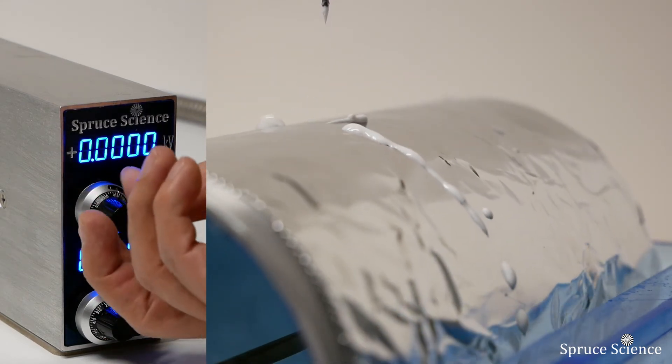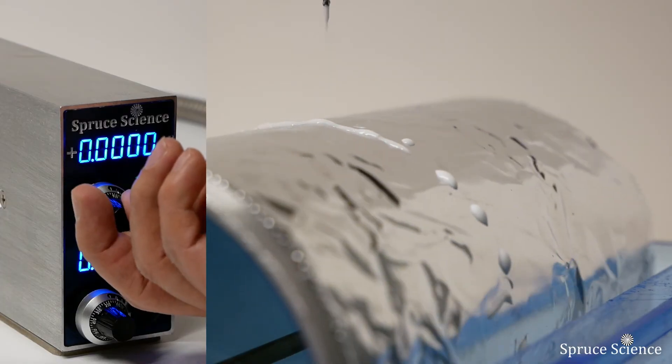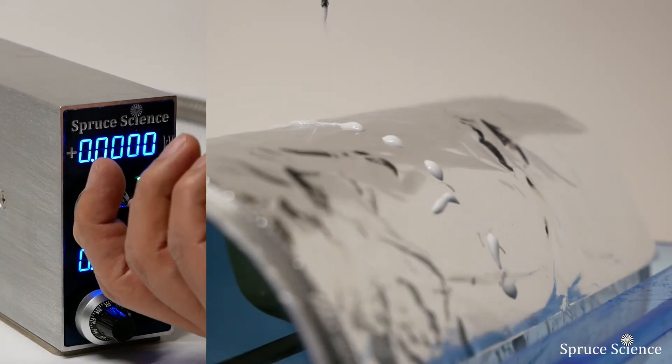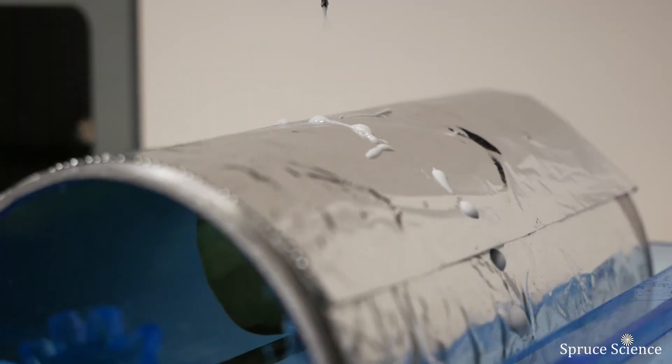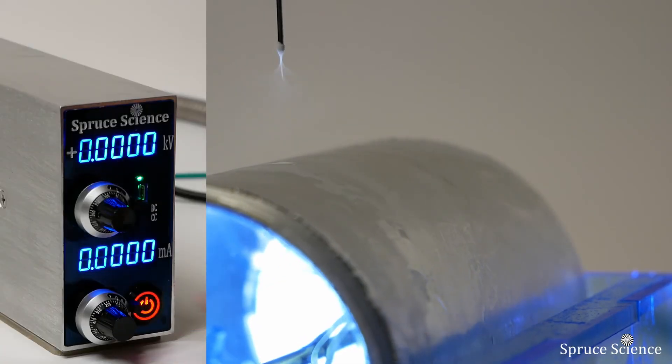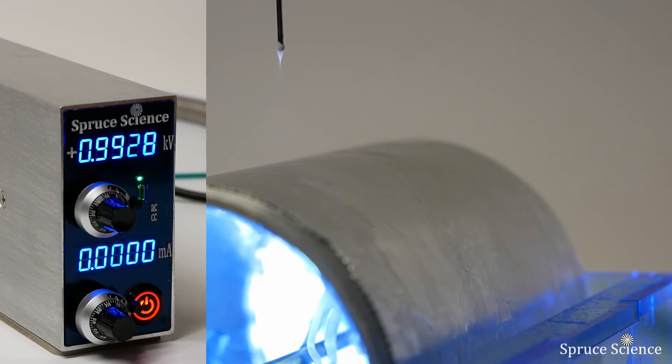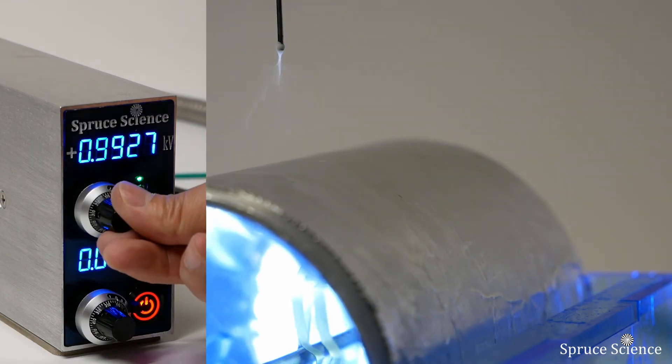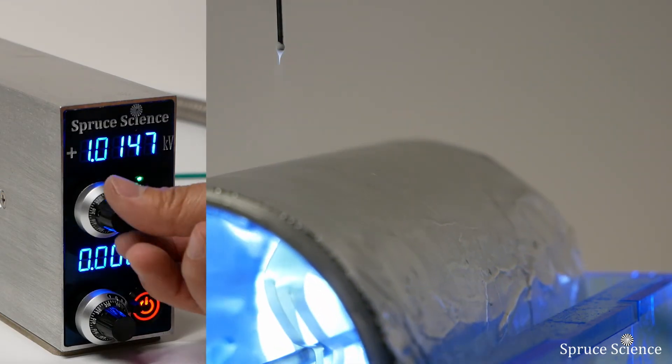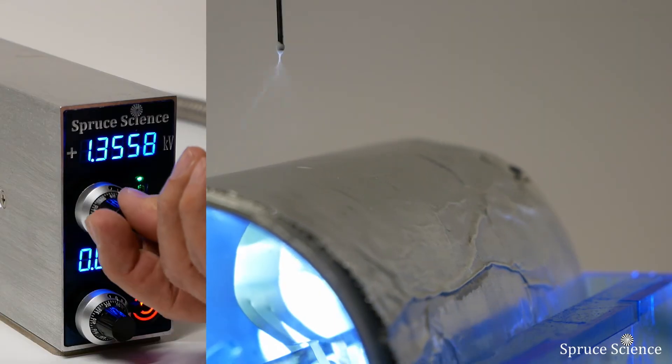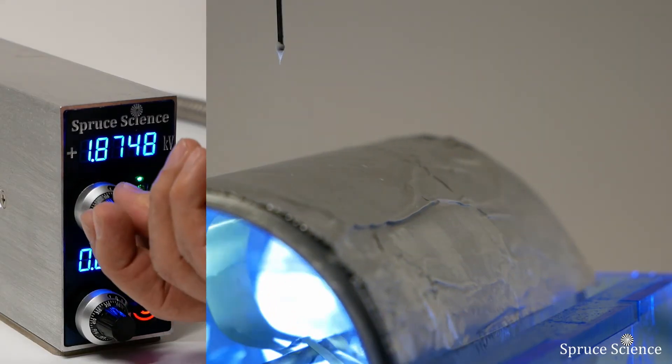Next, set the high voltage using the dial indicator. When everything is in place, turn on the high voltage output. Observe the electrospinning action and adjust the high voltage value, collector speed, and pump flow rate to get the desired result.